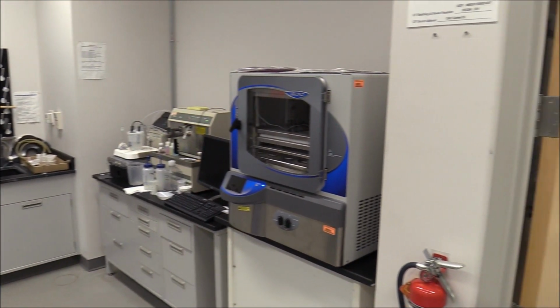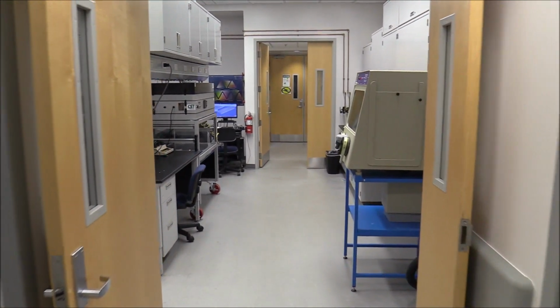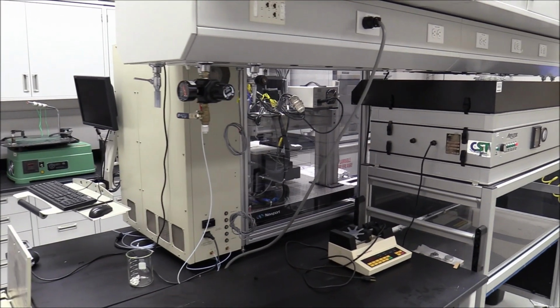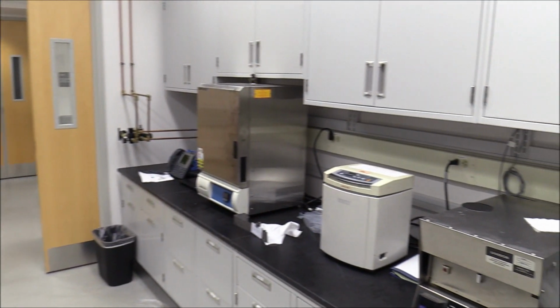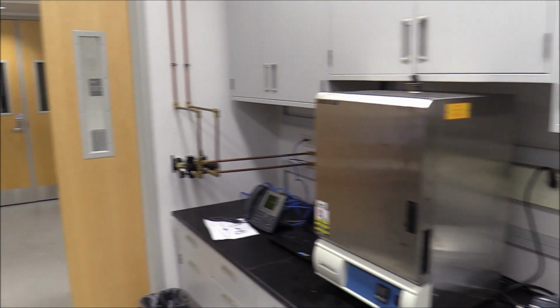Now, heading across the hallway, we're looking at the Advanced Manufacturing Lab, where you can find a clean environment bench for manipulating samples without being exposed to air particles. Now, just to the right of this bench, we have the PDMS preparation area. The PDMS is used to create an optically clear film on the surface of a wafer, typically used as a see-through layer for microfluidic devices.